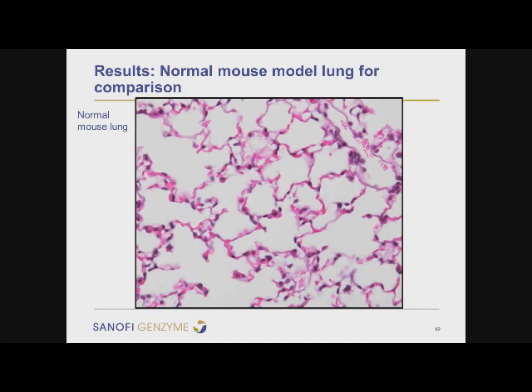And this is on a little higher magnification, so you have these tiny little alveolar septa. They're so small that you really have only one red blood cell fitting through each one of these little blood vessels here. And this is where, of course, your oxygen exchange occurs in that space.